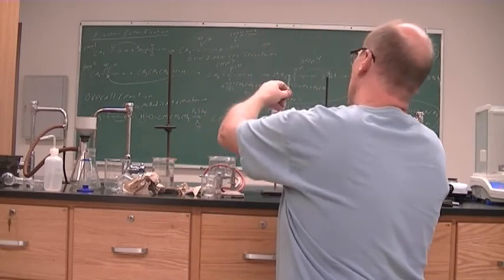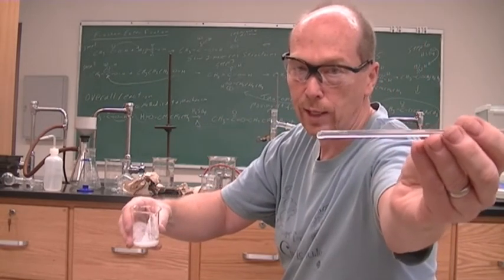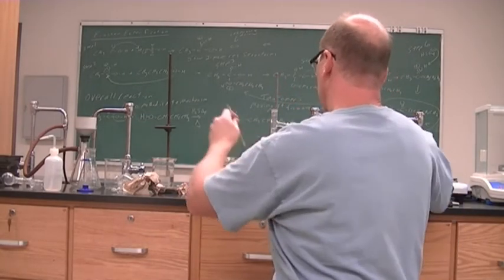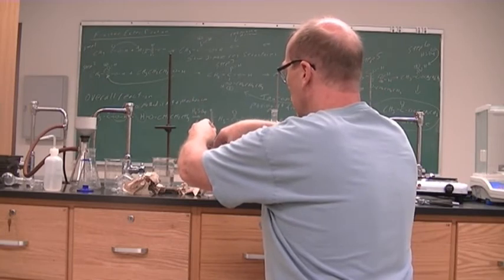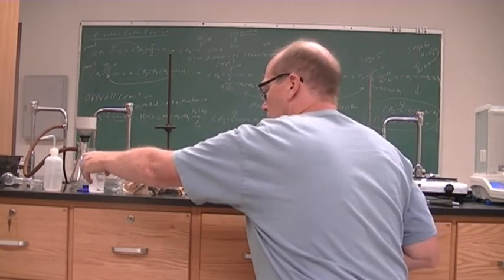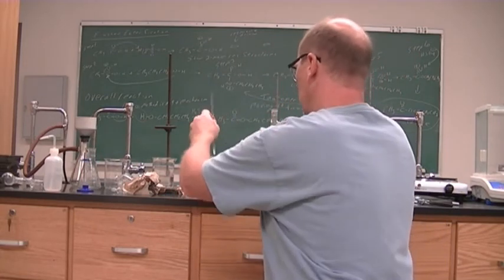Alright, so that is the proper way to do a decanting, although you can see on the stirring rod it was just running down with the liquid. So we're going to have a little bit of our magnesium sulfate in there. Alright, so fine. We are not looking for 100% yield. We got some liquid in here that definitely should be able to separate from this.